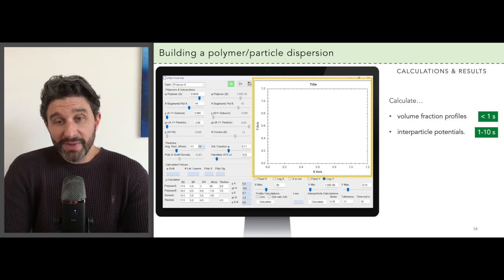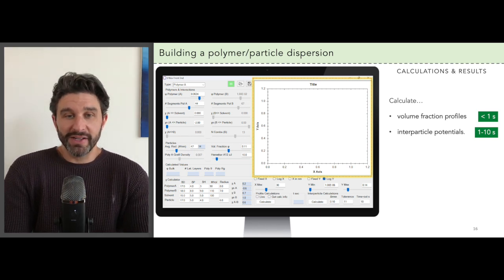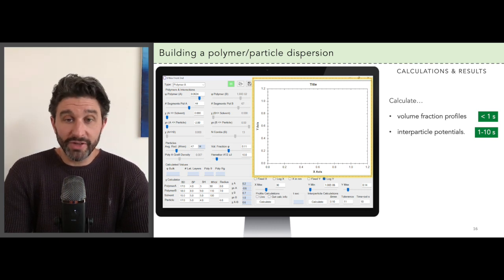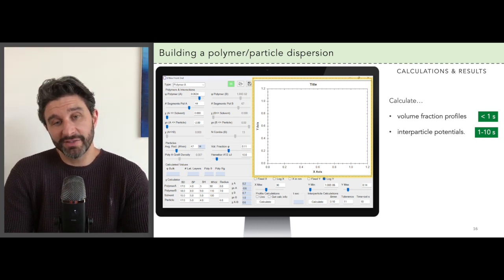So the cool thing about this app is that it's actually almost a real-time experience where you can change the parameters as you wish on the left and you see the results update almost instantaneously on the right hand side.